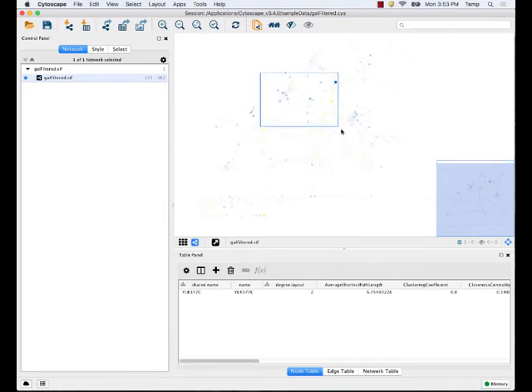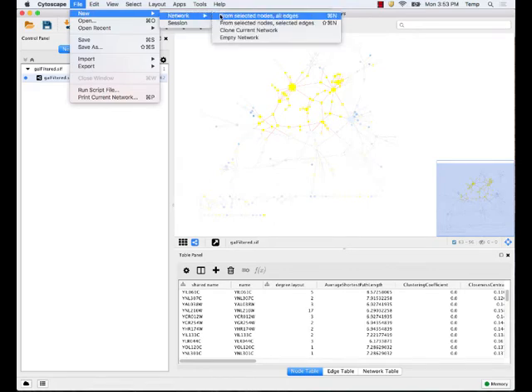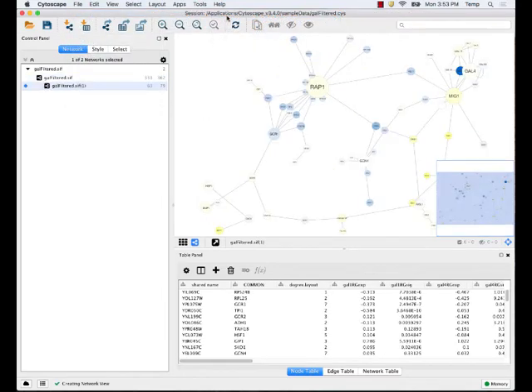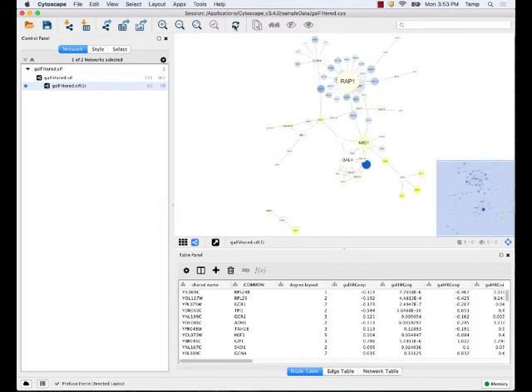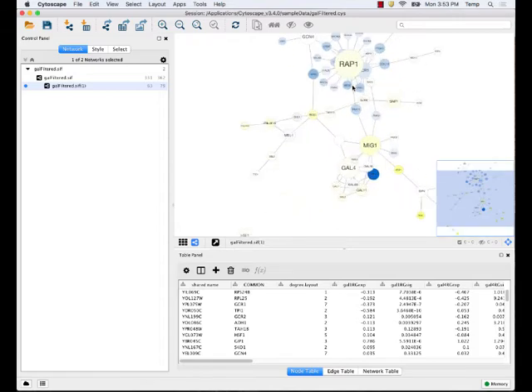You can take some part of the network, select it, and make a new network out of it: 'New network from selected nodes, all edges.' That makes a new network just from the parts you selected, and you can lay it out again using the preferred layout — one of the force-directed layouts. The bigger the network, the harder it is to lay out. If you make smaller versions by filtering somehow, you'll usually get a better view.